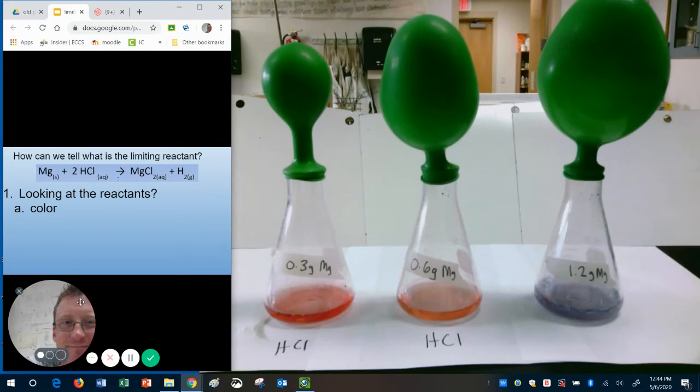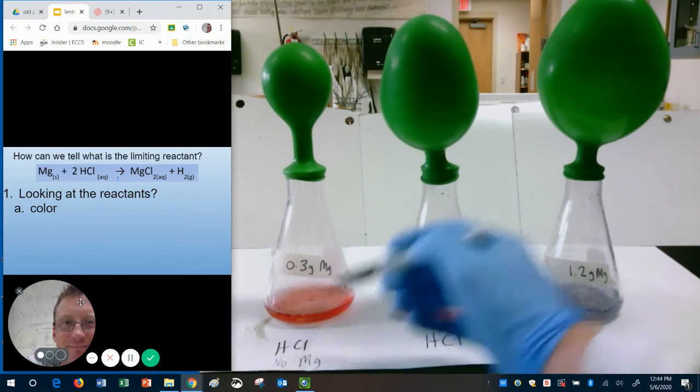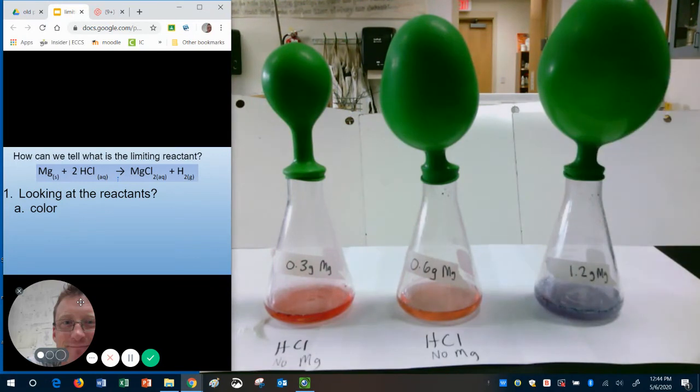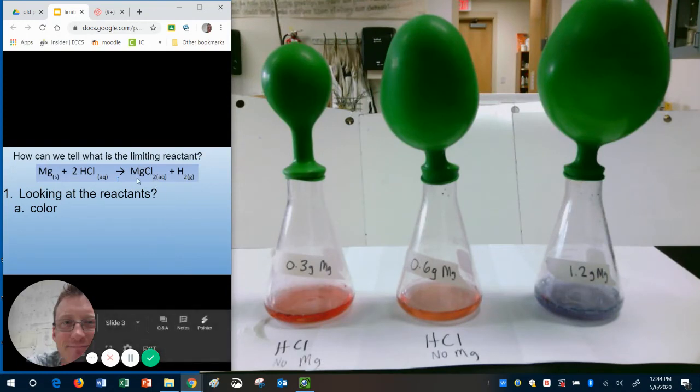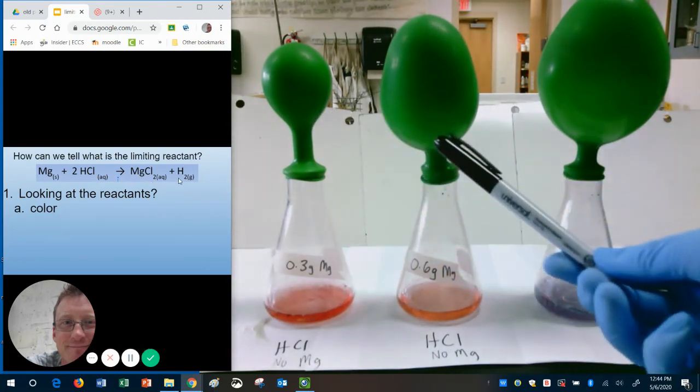What must have run out? Well, there must no longer be any magnesium powder. There is no more magnesium in either of those. Why? Because they turned into their products. We created magnesium chloride, which is colorless, and we created hydrogen gas. That's why the balloons inflated.